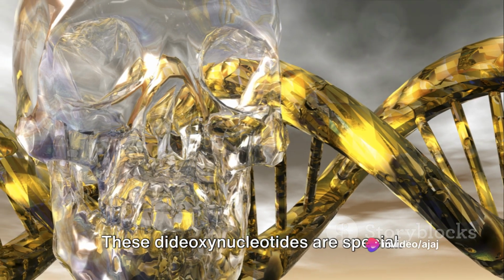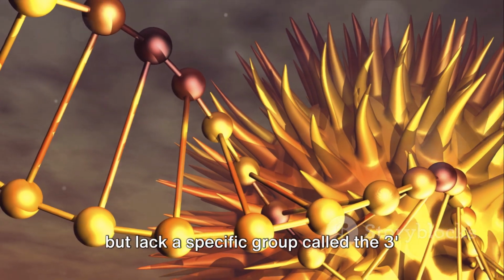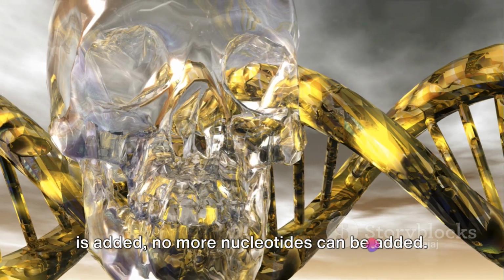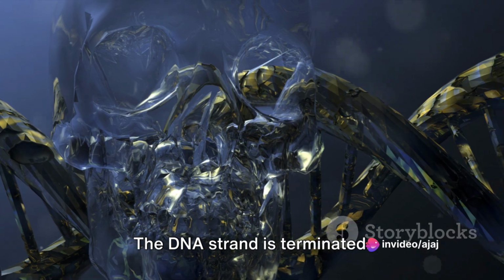These dideoxynucleotides are special. They are similar to regular nucleotides, but lack a specific group called the 3-hydroxyl group. This means that once a dideoxynucleotide is added, no more nucleotides can be added. The DNA strand is terminated.